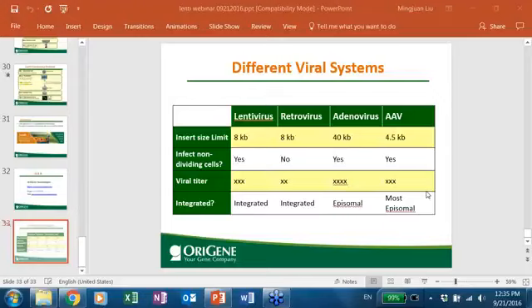Okay. Another question is a very detailed question. How many times do you harvest the supernatant for the lentivirus? One time or two times? So you can harvest two times. The titer changes a little bit. The second time is a little bit lower, but you can harvest both. Like day 4, that's the first time, and you can add new media and harvest again on day 5.